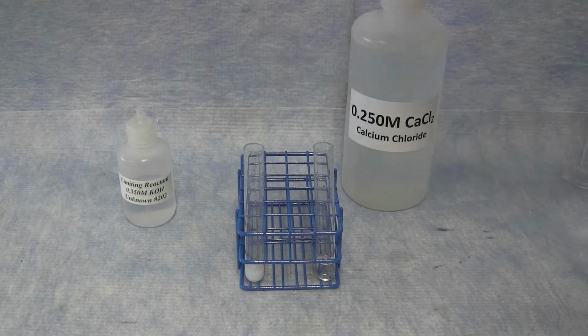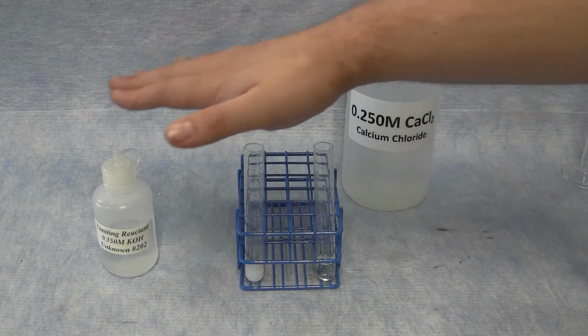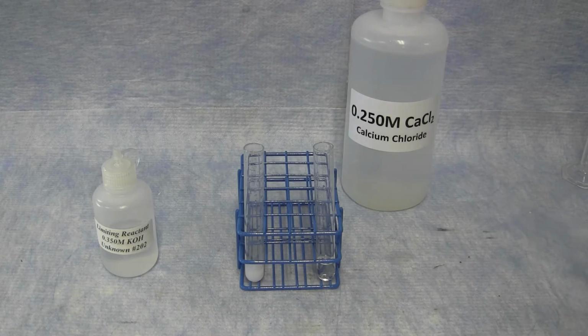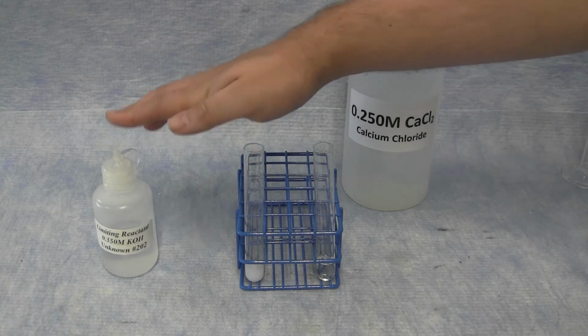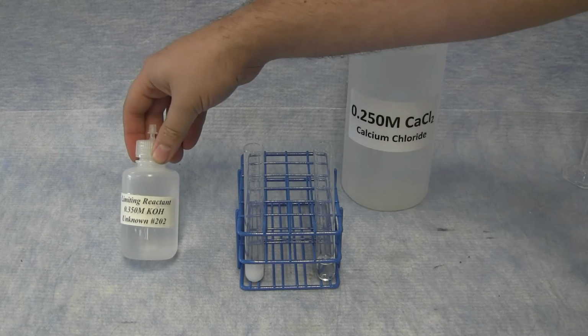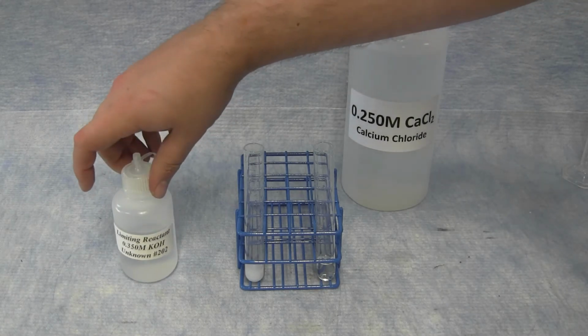For the potassium hydroxide unknown, you'll continue and perform the same setup, determining what is the limiting reactant, the calcium chloride or the potassium hydroxide. However, with the potassium hydroxide, you are given a concentration.